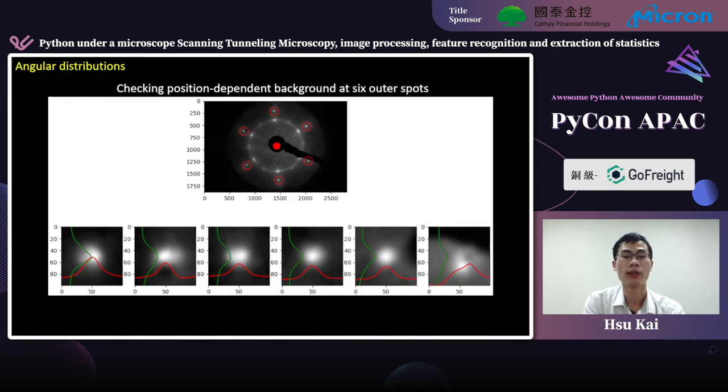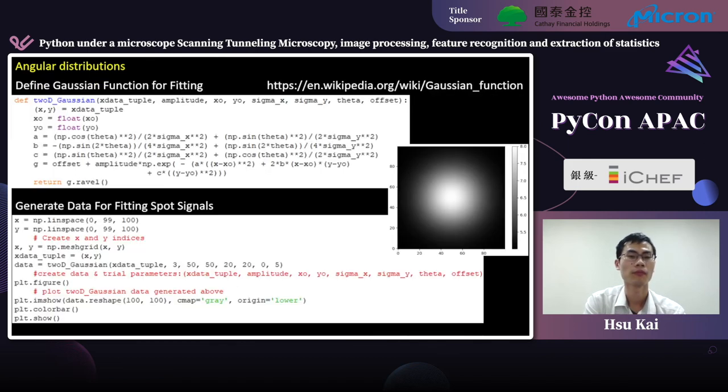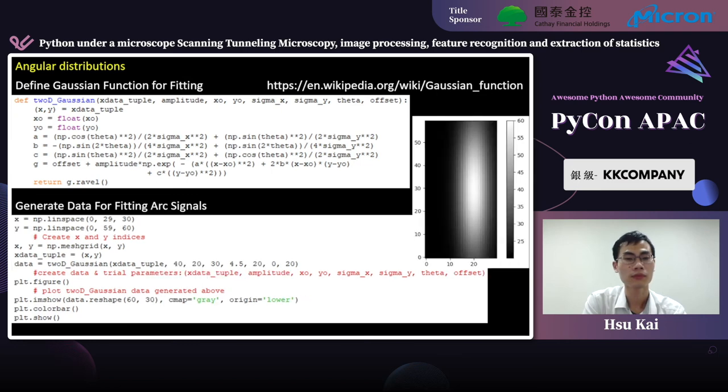So, now, if we zoom in and take a closer look at those six outer spots, we can notice that the signals are actually Gaussians along both directions. And since Gaussians are what real physical signals should be like, we will fit Gaussians for those diffraction patterns for both spot and arc signals. As you can see, before fitting, those Gaussians are a bit deviated. Here I use NumPy to define a 2D Gaussian function for me. And I define the 2D Gaussian, both symmetric and non-symmetric, along x and y directions. And you can visualize them after you define them.